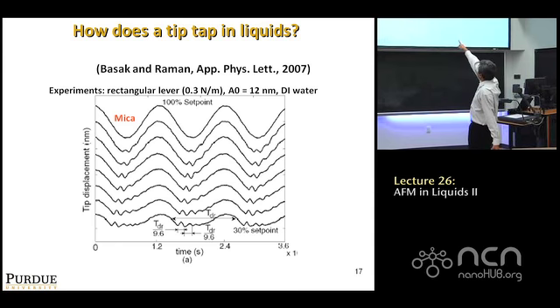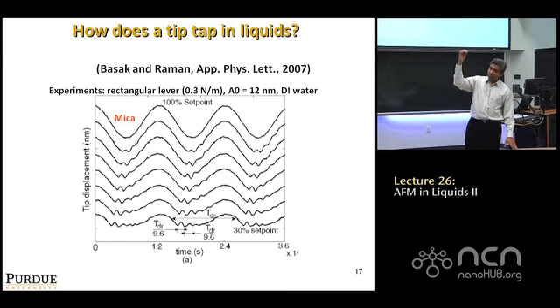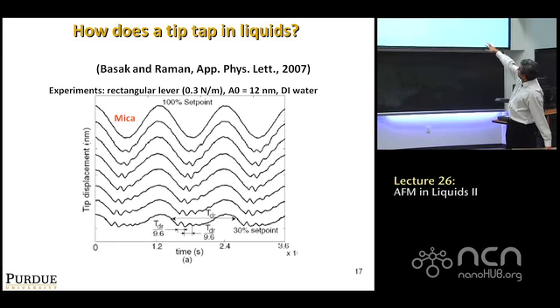You know, he saw that there are these bumps that start coming at the very bottom. They are very similar to the bumps that Putman observed, except that this was a magnetic excitation. So the bumps always happened at the bottom, and they had to do with when you were actually tapping or impacting on the sample. So the bumps are very similar, except that when he studied this very carefully, he found that these bumps are not isolated, that as you come closer to the sample, you see that the bump actually is the starting point of a little ripple that dies out.